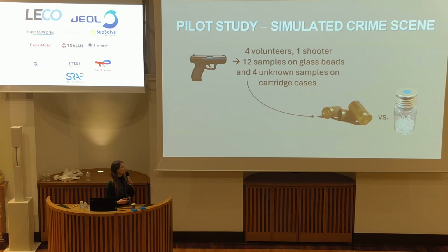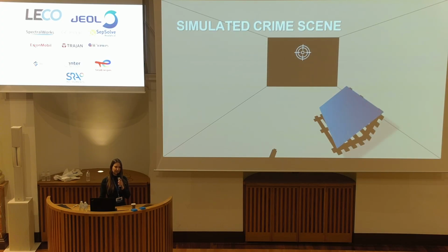So in this pilot study, we built a simulated crime scene with 4 volunteers, and one of them was our shooter. And we obtained 3 scent samples from each volunteer on the glass beads, as we normally do. And then we have 4 unknown samples on the cartridge cases. So this is how the simulated crime scene looks.